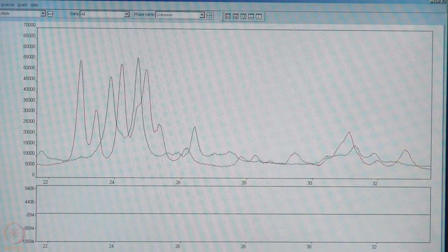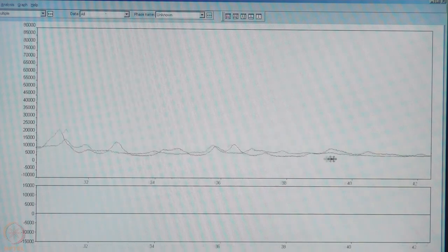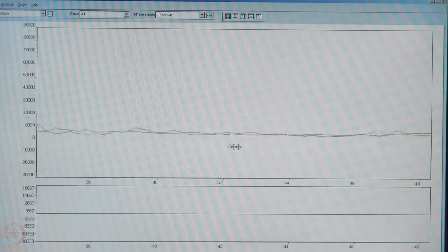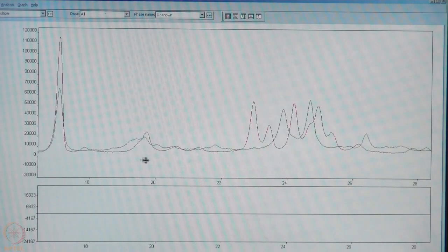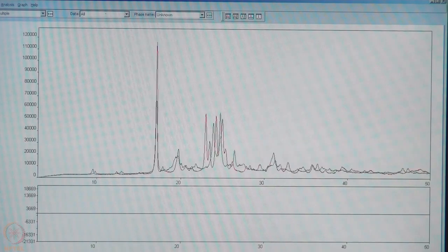This particular case, where the sample we know has originated from one particular compound and is giving two different crystal structures with two different sets of peaks appearing at different points. So, this is how one can identify polymorphs using powder X-ray diffraction data.